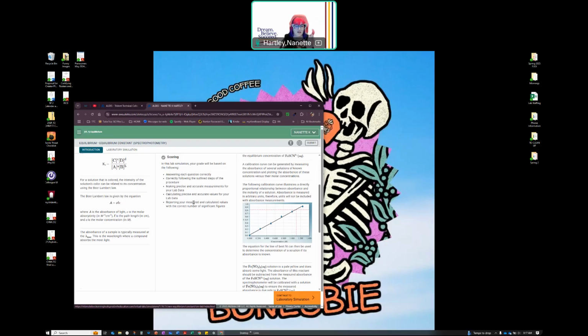And it's always done at the wavelength of highest absorption. So that way we get the maximum signal out of this particular thing that we're trying to measure. So we want to maximize the signal that we're getting. And so we do it at the place where we have the highest response for the solution that we're looking at, okay? So when we talk about taking data from instruments, we have to figure out what's the best way for us to do this.